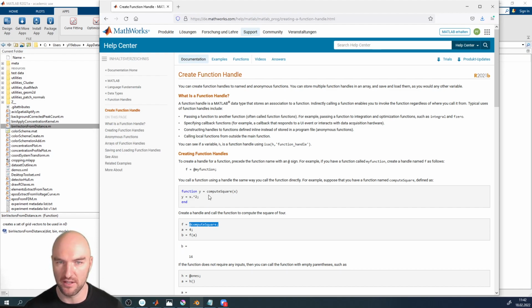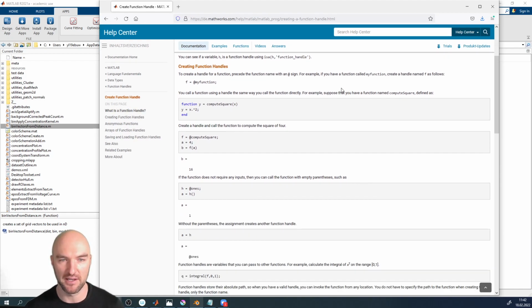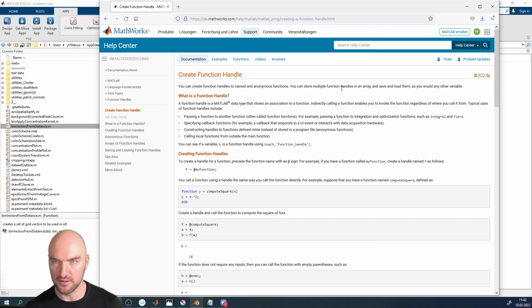Obviously, that's not a particularly helpful function because it's just one line. But in our case, the function we are talking about is a function that calculates a concentration. But we can have any kind of function we want. And the function we are providing you for concentration for now is calculate concentration simple, which is just taking the ion allocations we did with the ranging, and then applying that function. But you can use any function you want.